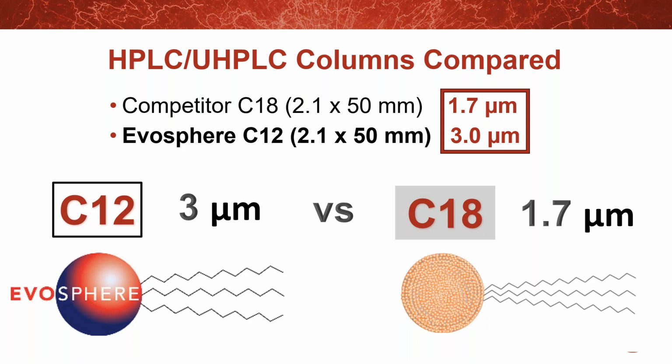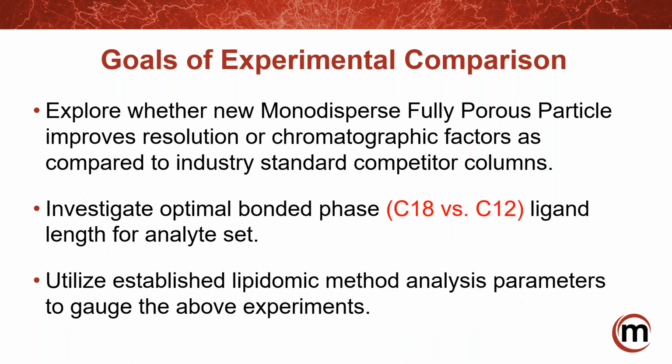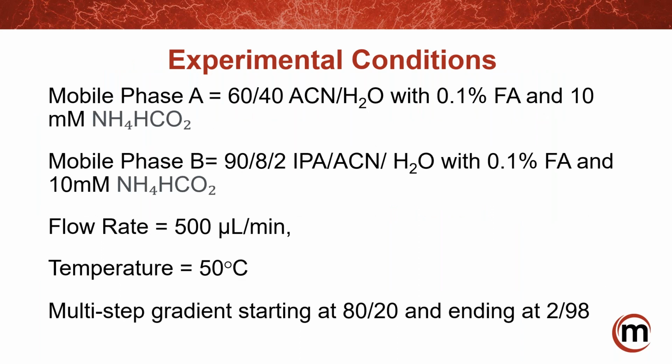So we're really excited about this phase. What I would say the goals of this experiment were: to take a method that was established, that had been running for a long time, to not adapt the method, but really just to take a column using a new particle technology, using a new bonded phase technology, and to put it into that separation and see how it does. And we were really blown away by the results.